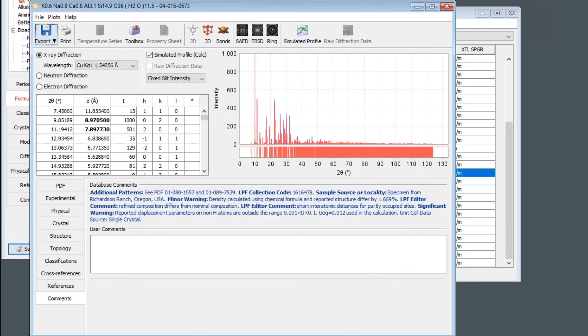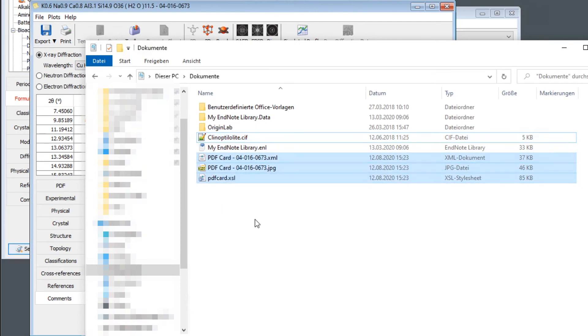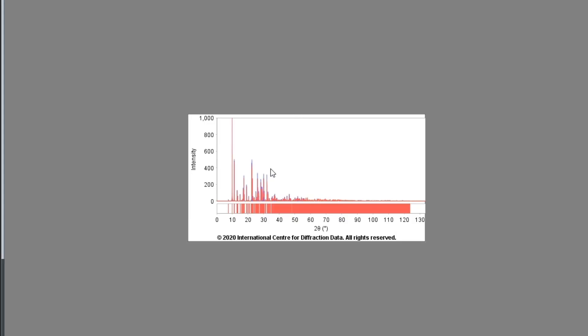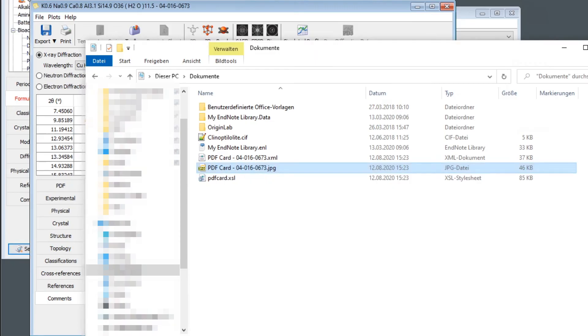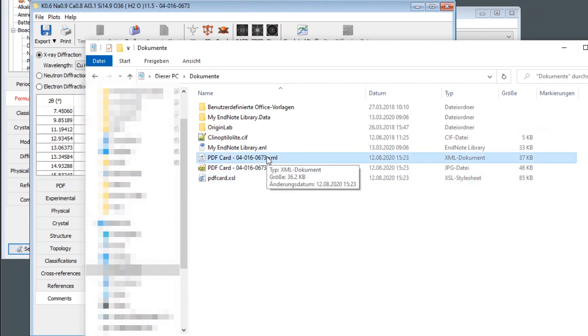And now if I go to this folder, it created three files: an XML file, this is the one we need; a JPEG file, which is just a preview of the diffraction pattern from the database; and some additional file we don't need. So this XML file is what we need for Profex. And we will now try to import it in Profex.